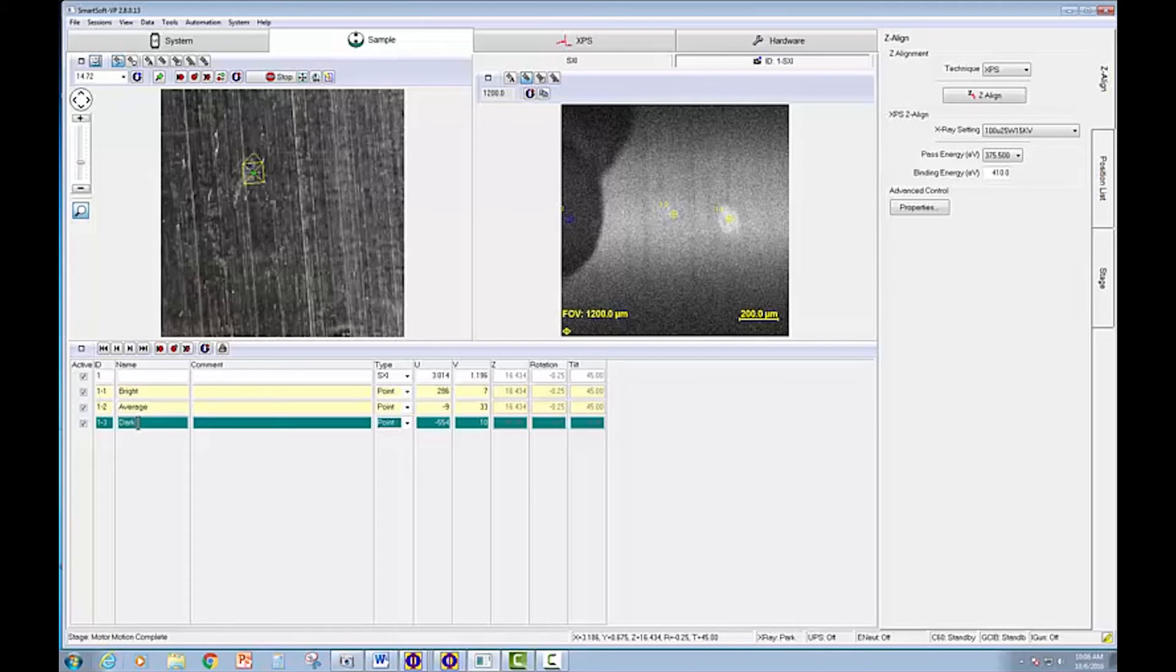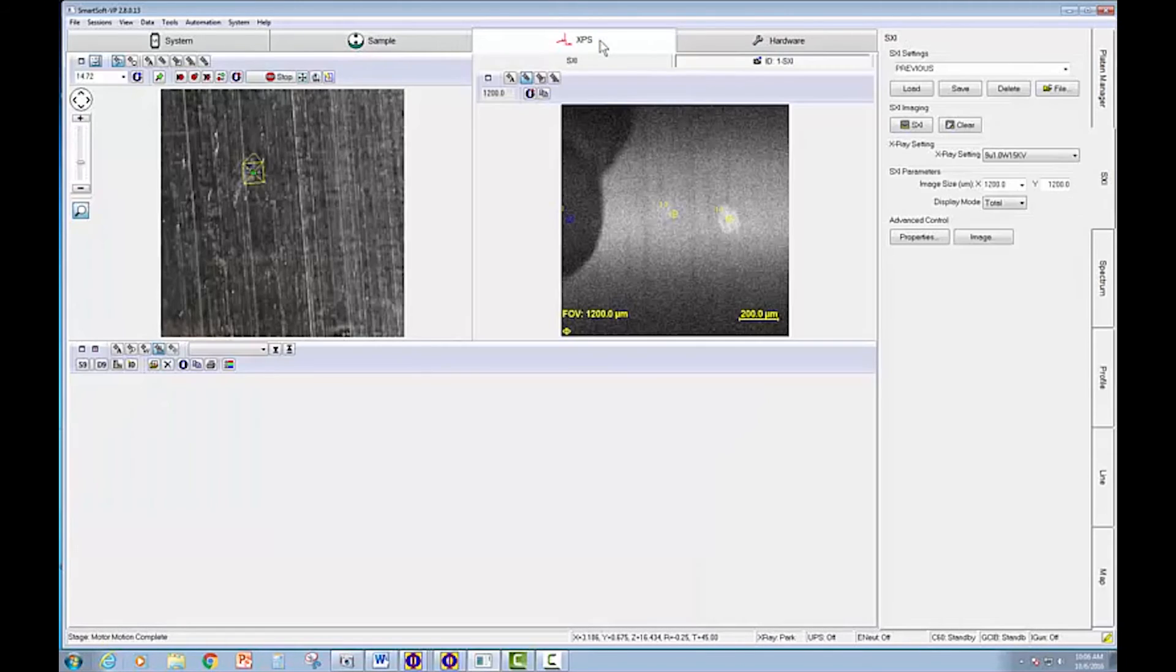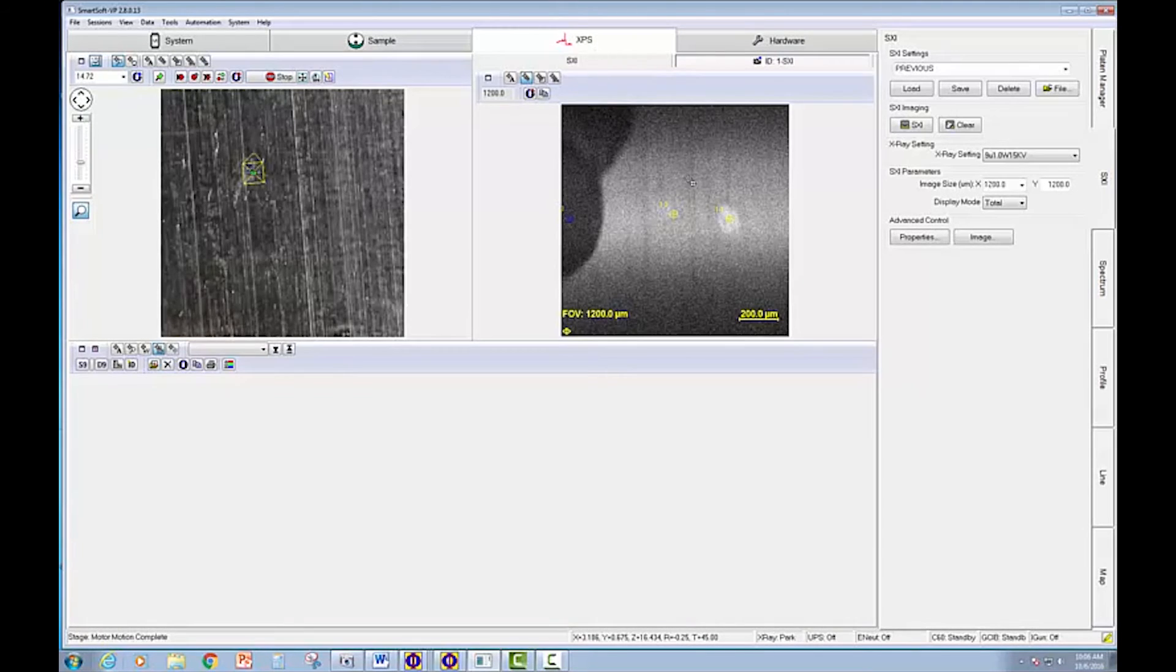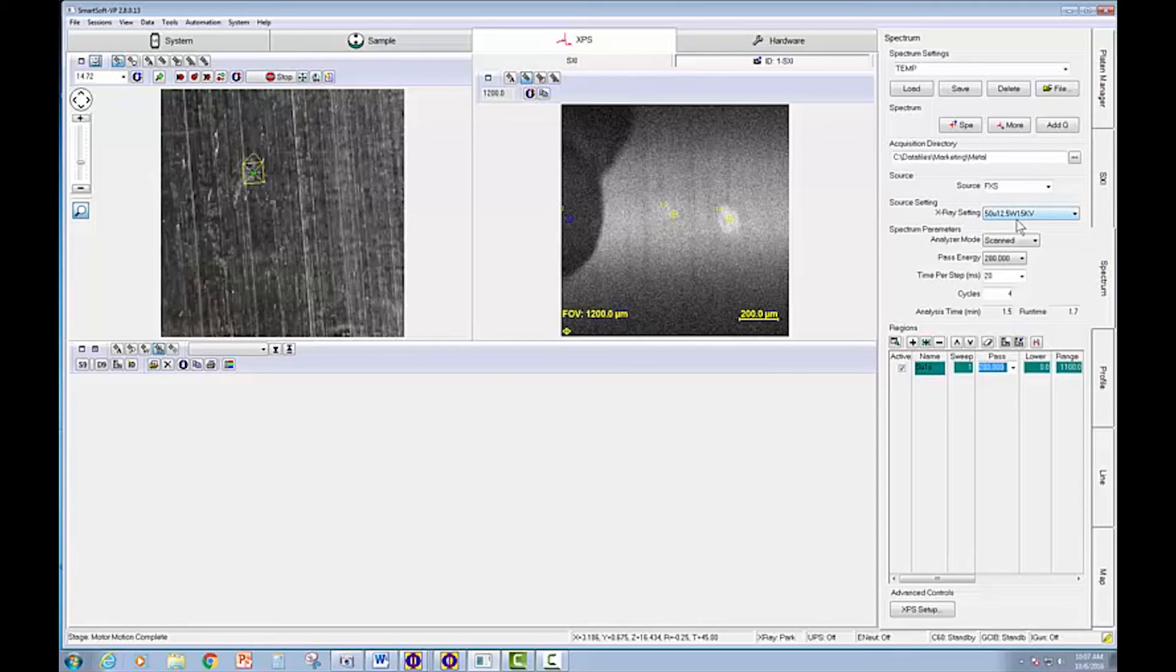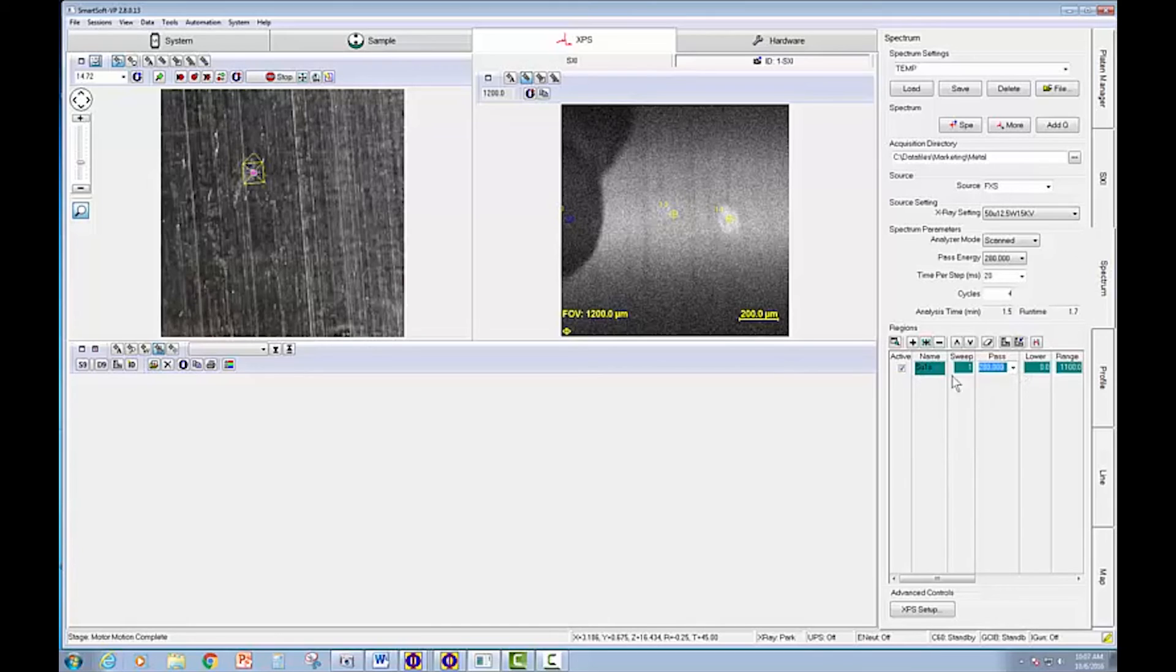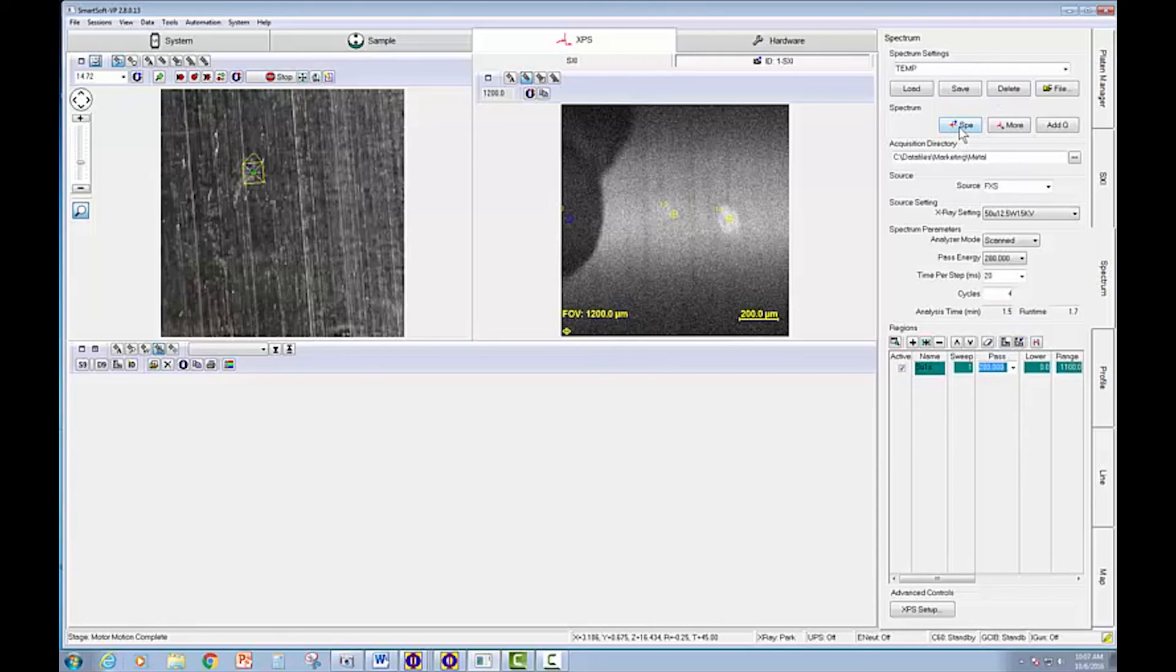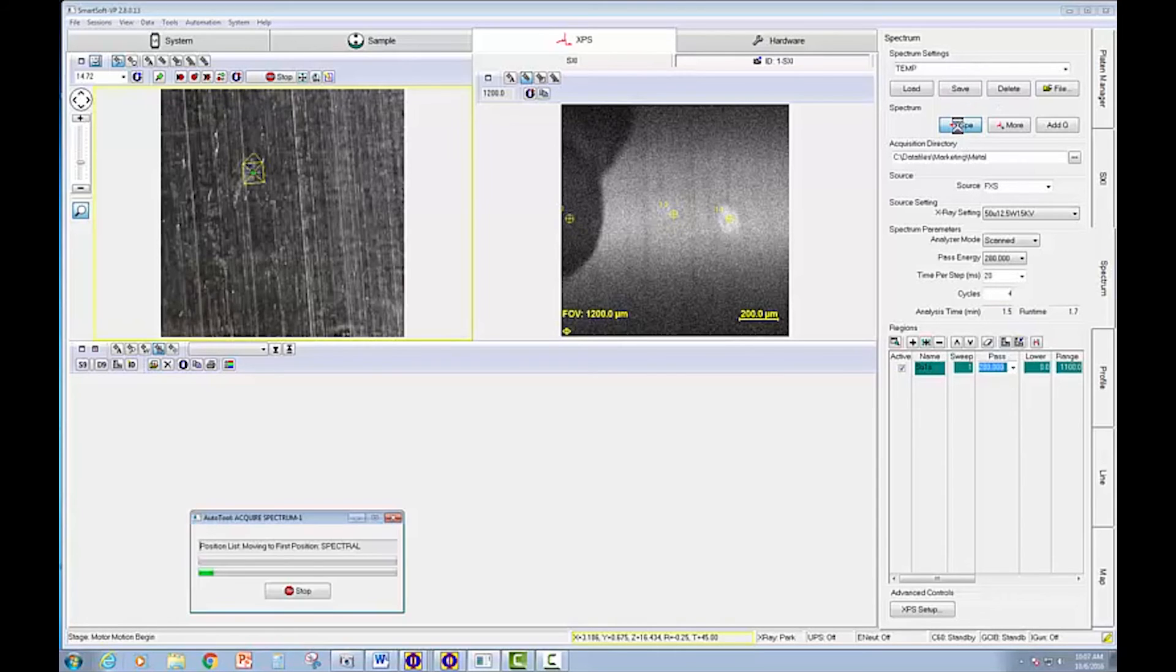And then we'll switch to the XPS tab and ask for a spectrum analysis. We have a 50 micron X-ray beam selected right now. That seems to make sense with the size features we have. We have a survey spectrum already defined. So we'll just go ahead and start the acquisition.